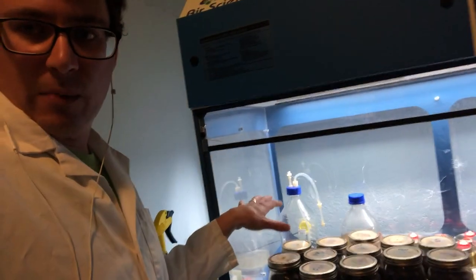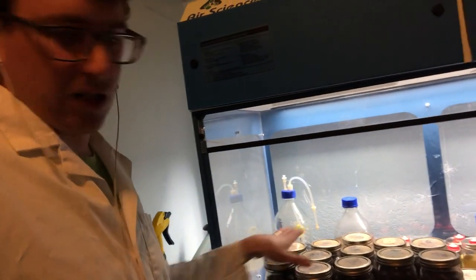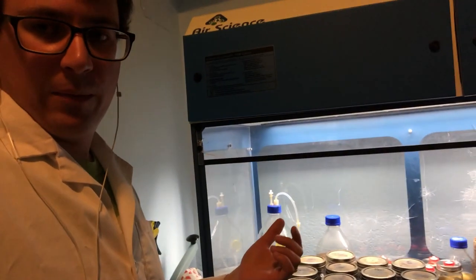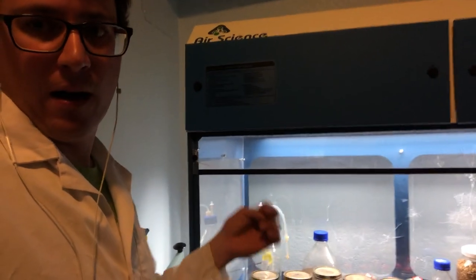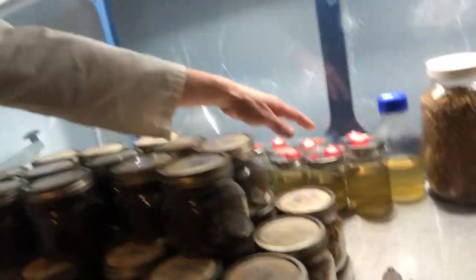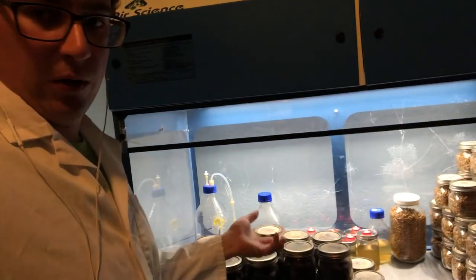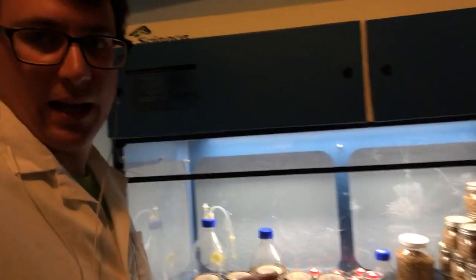And I really like doing my QC out of here too, because just like extracting all of these liquid cultures, you're getting a better representation because the stir bar is mixing up the solution. So if you have any bacteria or yeast, it's going to show up. Whereas if you take QC too early on some of these other jars that I usually do, there's a potential that you could miss some of the bacteria, and then that will grow inside the syringe, and you'll be wasting all of that time and material.